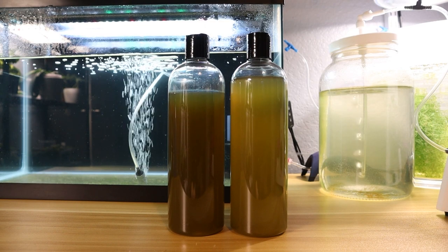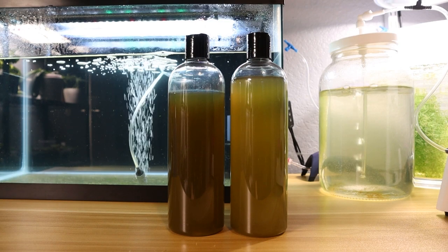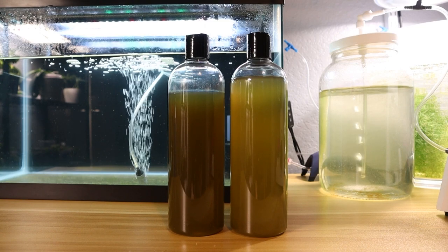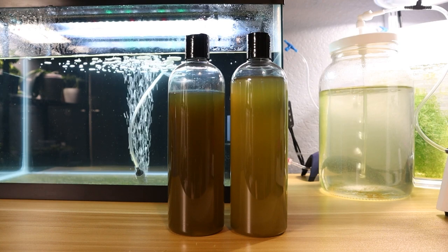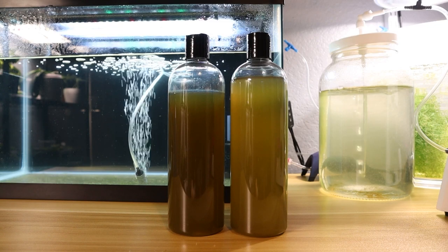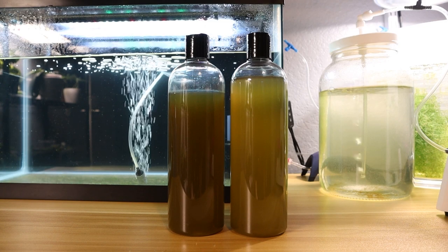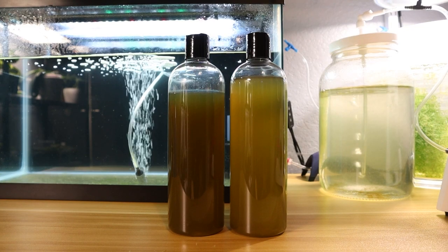Finding a good clean starter culture of Isocrysis is very important. It's easily contaminated, so a strict sterilization process is very important if you want to grow more of it. If you want to get the cleanest possible starter culture you can order from colleges or universities, but they're going to be super expensive — hundreds of dollars for 16 ounces or even less. So instead, we just buy from hobbyists to save money.